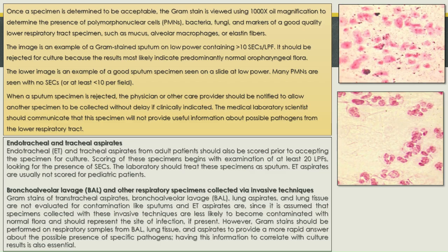However, gram stains should be performed on respiratory samples from BAL, lung tissue, and aspirates to provide a more rapid answer about the possible presence of specific pathogens. Having this information to correlate with culture results is also essential.